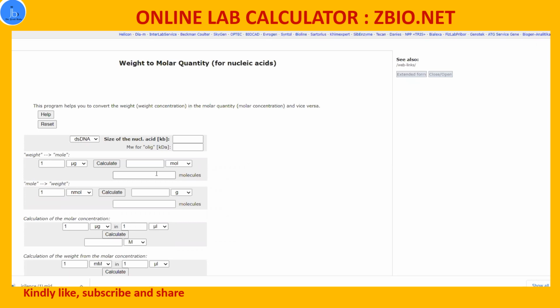Because if you are running very specific real time PCRs and aptamer kind of projects, then how many molecules of your nucleotide or oligonucleotide you are using is very specific. We have to calculate at the molecular level how many molecules are interacting with different macromolecules or different ligands and all those things. So all these calculations you can perform here. You just have to give the ideas which molecules, which oligonucleotide you are using, like double stranded, single stranded, RNA, or synthetic oligo, and how much you are using. Based on that, it will calculate and give the ideas.